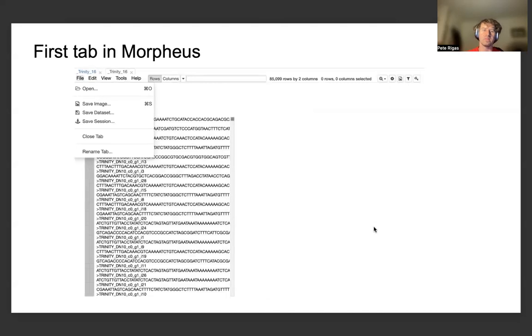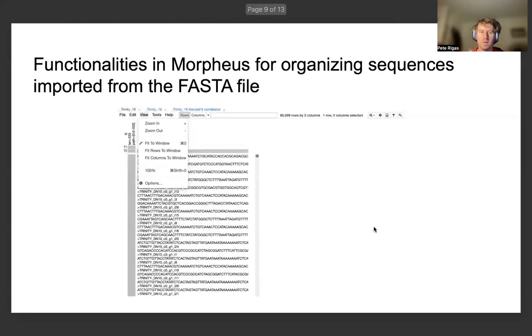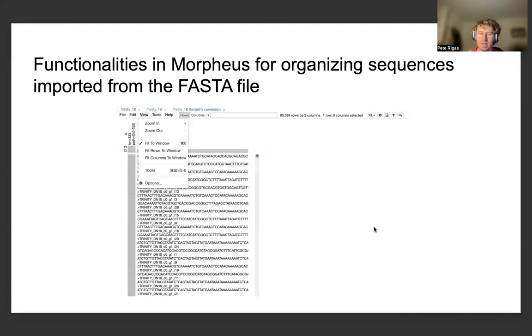In Morpheus, we can look at making different types of conversions between file formats. For instance, if we load in this FASTA file, we can use functionalities from the first tab in Morpheus to convert between different types of file formats rather than the FASTA input we initially loaded. Furthermore, we can make use of the interface to look at different types of sequences and group them together — for instance, isolating different commonalities or qualities from a couple of sequences from the approximately 40,000 sequences loaded into Morpheus.